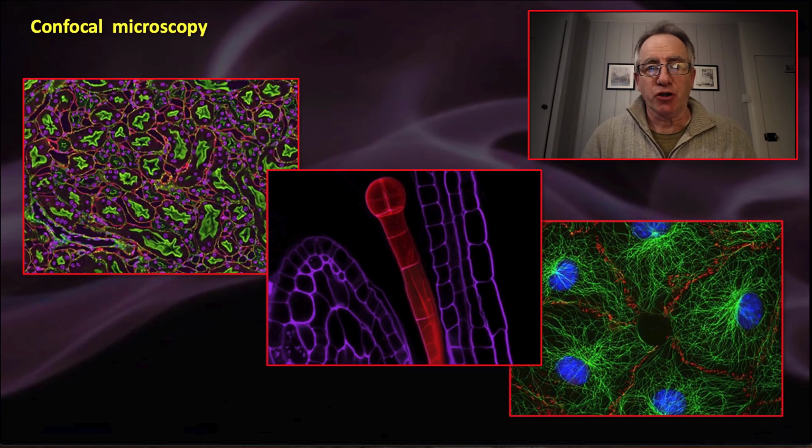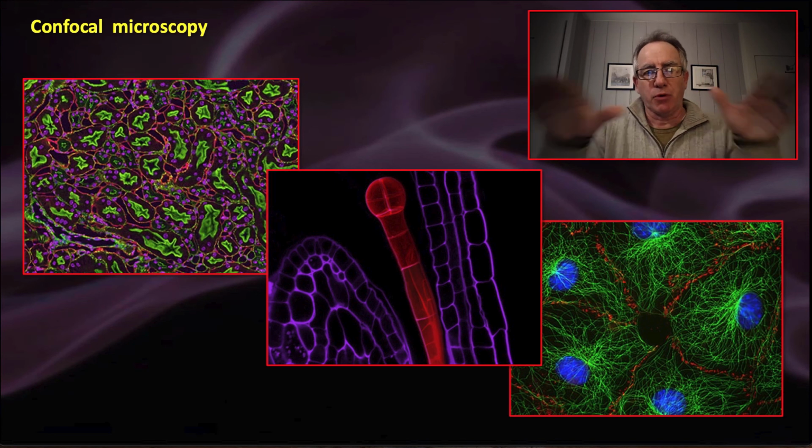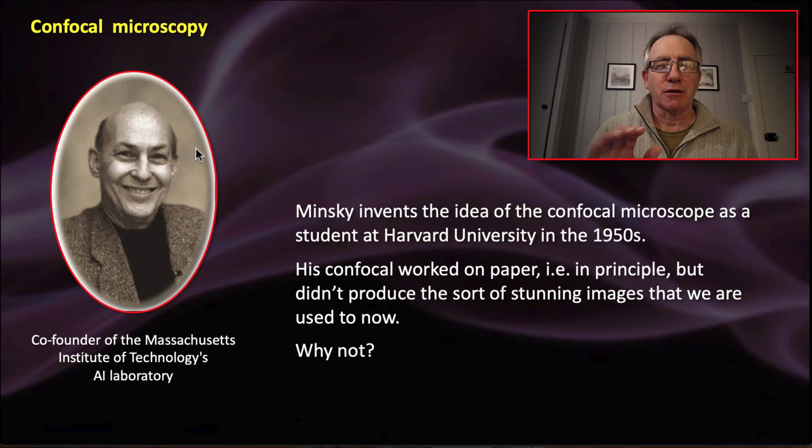And so in very short order, we've come to confocal microscopy. Fluorescence microscopy is the big umbrella topic here. Confocal microscopy is a subset of fluorescence microscopy, but it's a really big and really significant subset. And in fact, most research that's conducted in cell biology these days is done with confocal microscopes. They allow you to make, well, absolutely stunningly beautiful, clear images of biological specimens in all sorts of fluorescence colors.